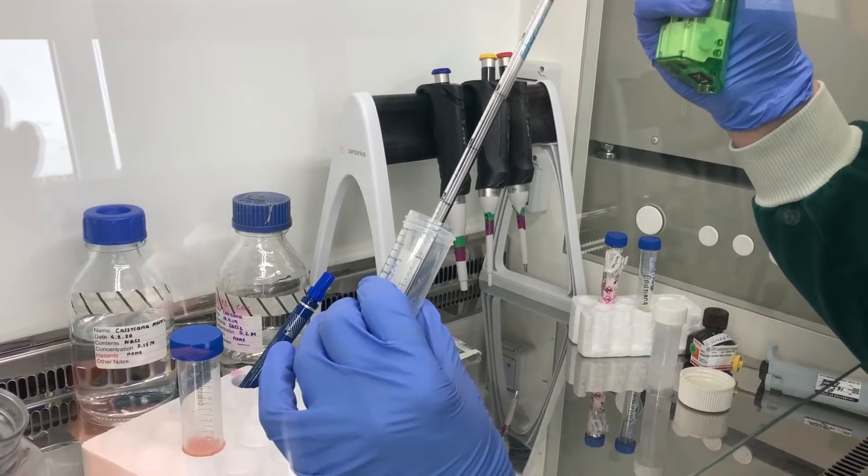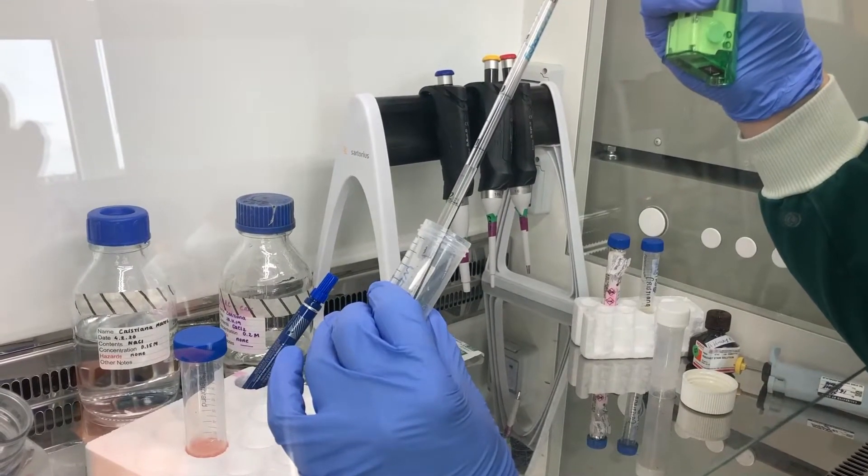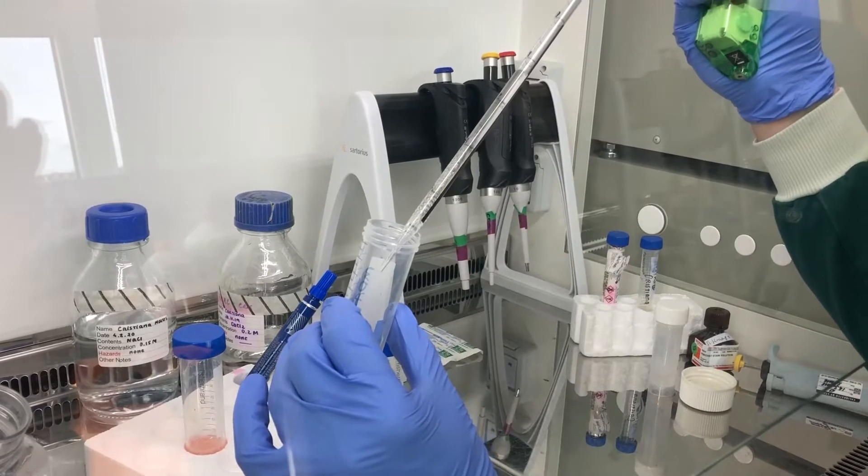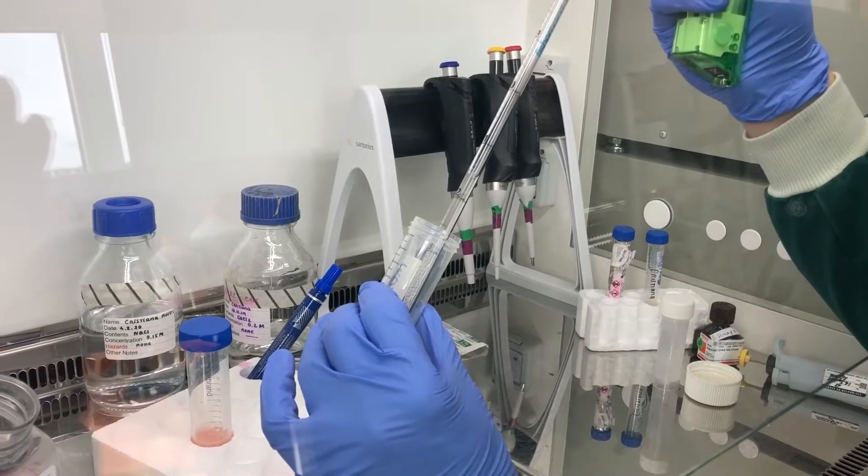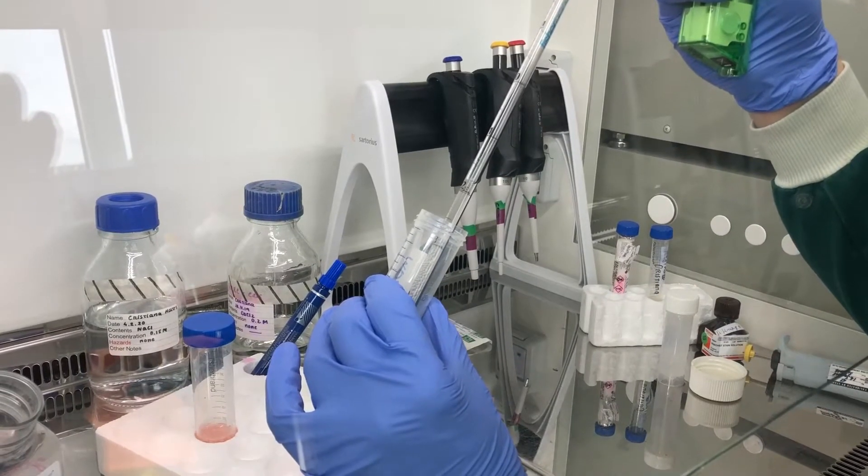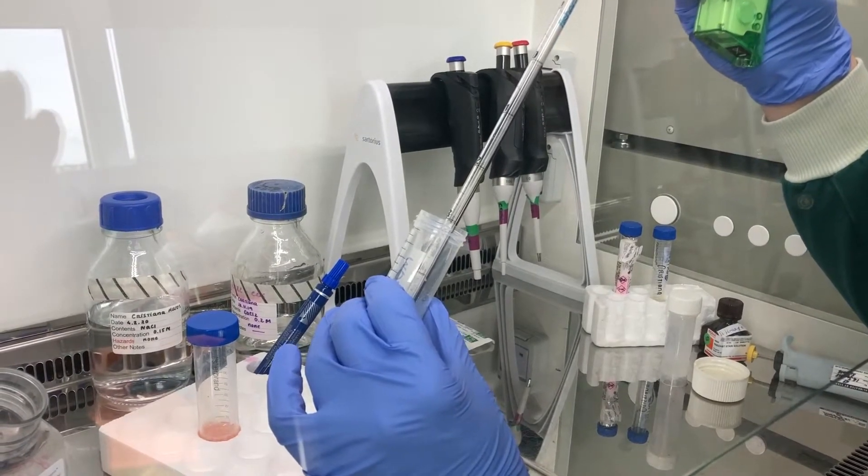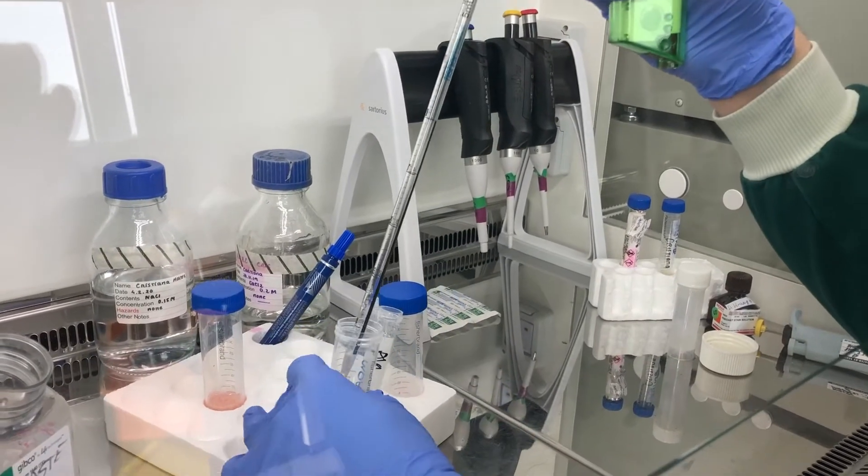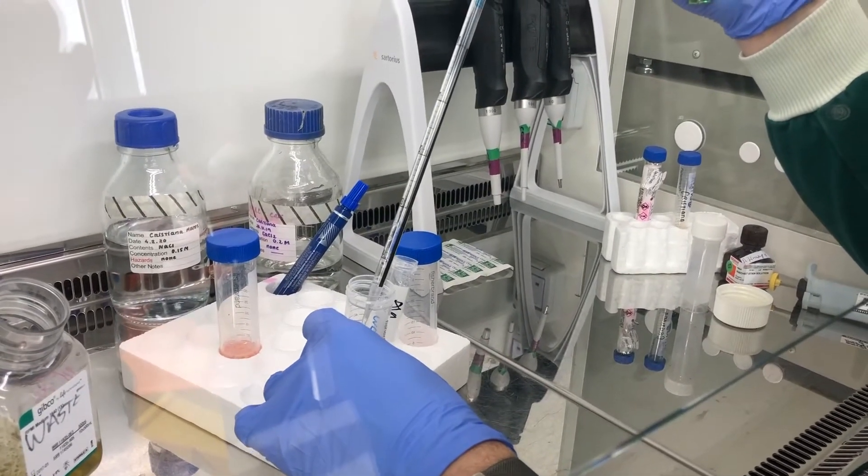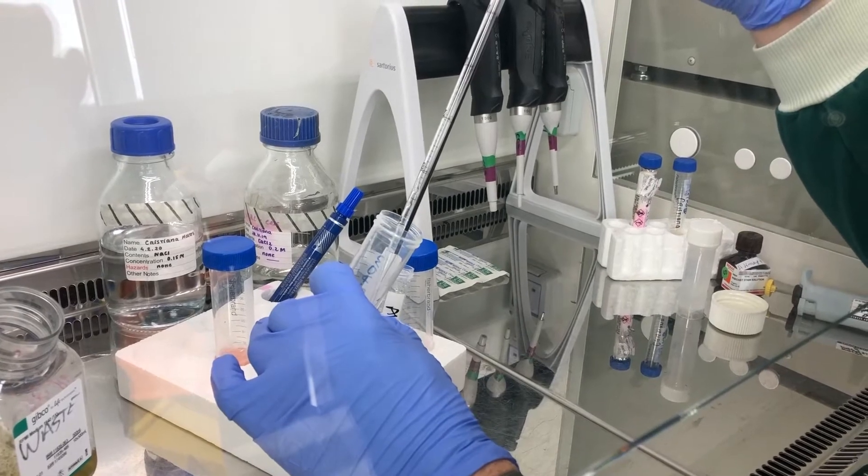So add it to the cells and you have to give those a really good mix. What you don't want to do is create air bubbles like I've just done, so try to avoid doing that because those air bubbles will mean that you get air bubbles within your alginate beads and they will float and that will cause you a problem. So you don't want to get air bubbles even though I've just put air bubbles into them.